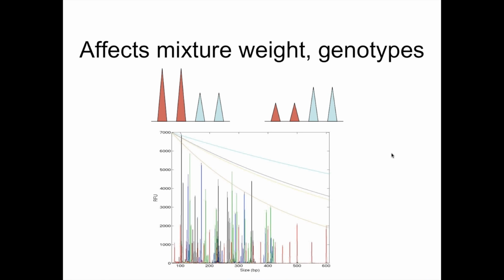But as we move from left to right and we get more out to 400 base pair, the increased degradation of the brown contributor may flip that pattern, and now even though there really is more of the brown contributor present in the tube, because of the cuts in the DNA fragment, it can't be read. And so we're not seeing it in the peaks.